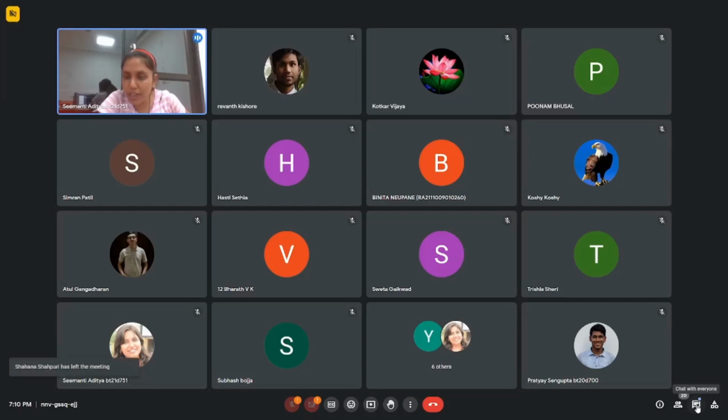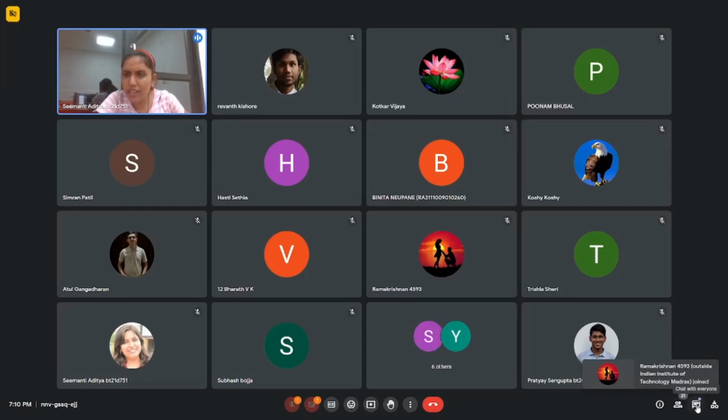So upright and inverted, I think it is. What is the answer? So yeah, the source of light and condenser. Wait, I will open my previous. So for the upright microscope it has to be placed below. I mean, wait. Let me share the screen.